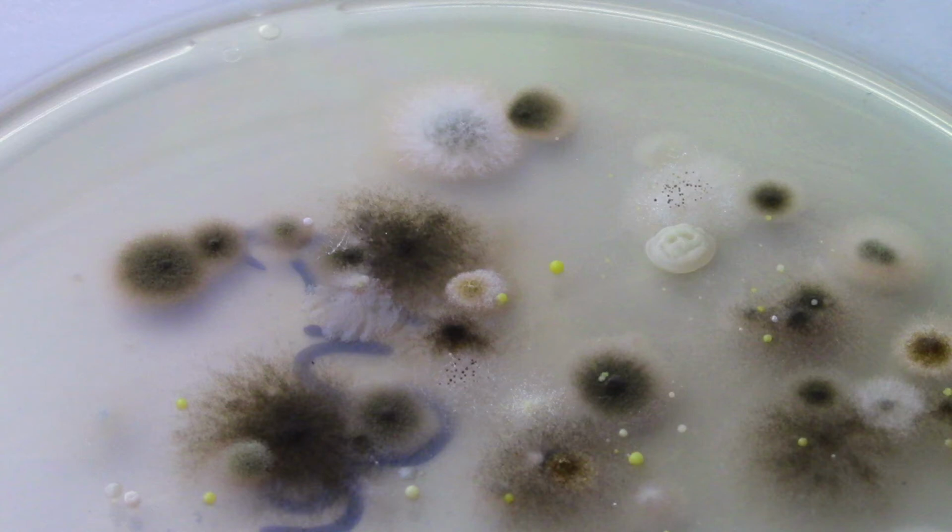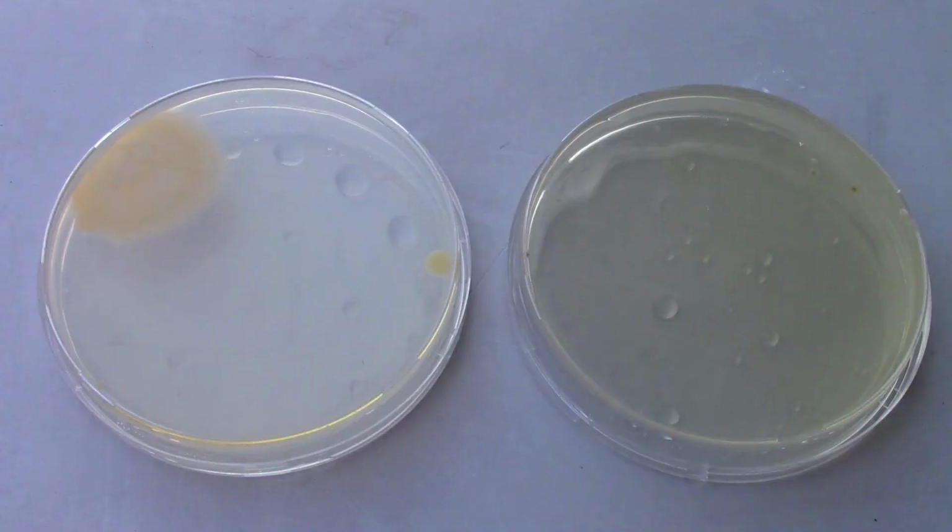It's fascinating to me. I mean, disgusting, but also fascinating to be able to see all the different kinds. Some are mushy, gushy, and dimply. Some are round and fuzzy and different colors and different shapes. And it's very interesting. I will say this picture is part of the experiment that I got sidetracked on. I was afraid that these Petri dishes would not work out because they were so old. Technically, I think there was a 90-day expiration date for the agar in there. But like I said, it was probably a year until I got around to using these.